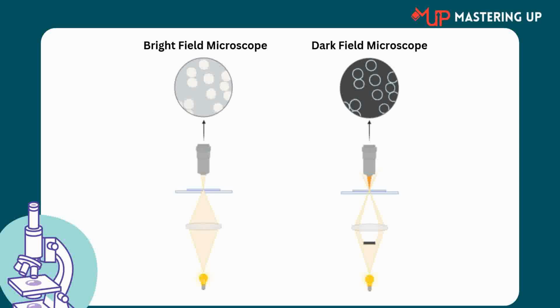Moving on to the dark field microscope, also known as dark ground microscopes. These microscopes have special condensers that will scatter light and cause it to bounce off specimens at a specific angle. Accordingly, specimens have dark backgrounds in dark field microscopic images. This microscope is best for extremely small live specimens and for viewing liquid samples, finding cells in suspension.